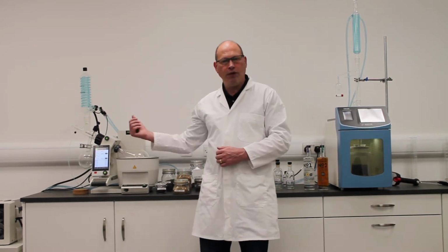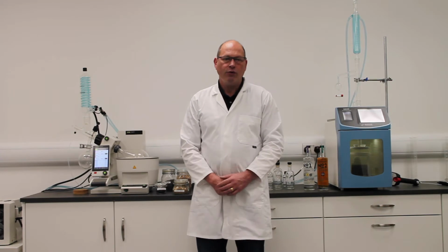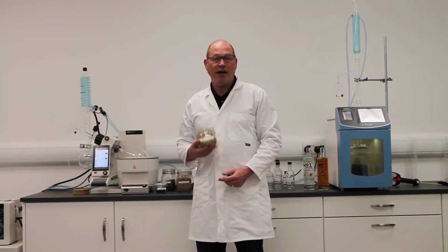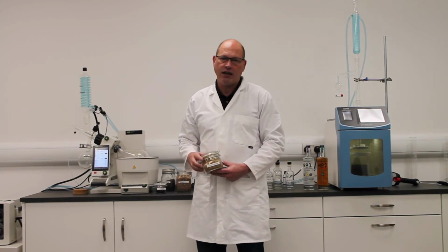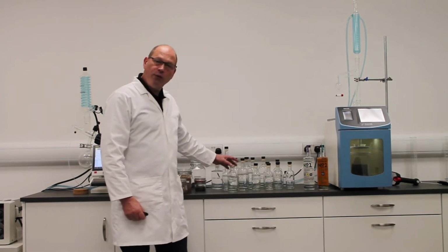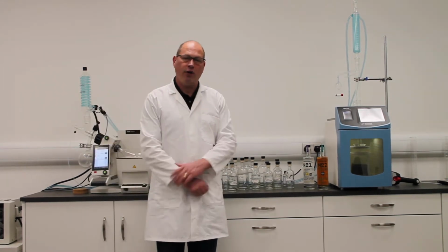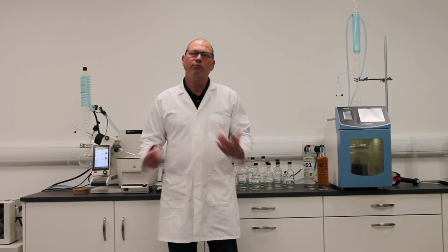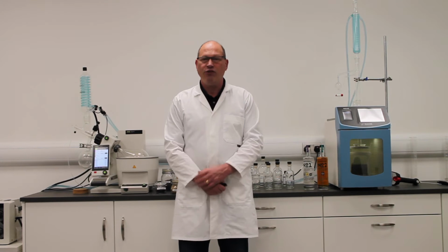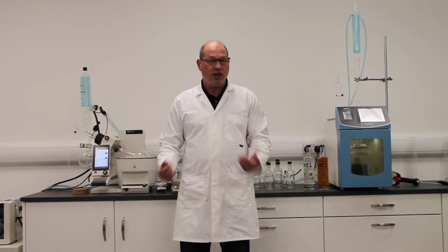flavours. Today I'd like to explain how we use science in our gin making, using the microwave still coupled with a rotary evaporator. So we distill our botanicals individually under the best conditions for that particular botanical. That gives us a super concentrate. And we add these super concentrates to a large volume of ethanol and water. So it's a multi-shot taken to the nth degree, and it's super efficient. It uses only 2% of the energy of a traditional still.